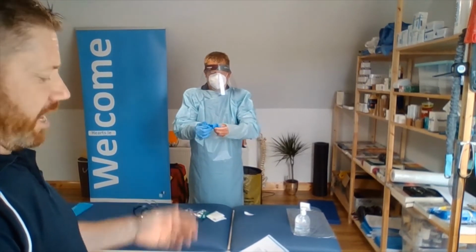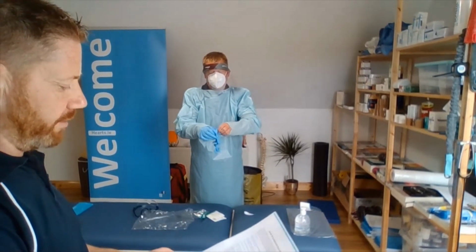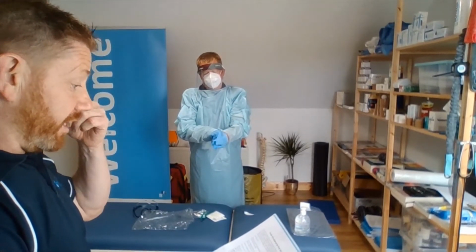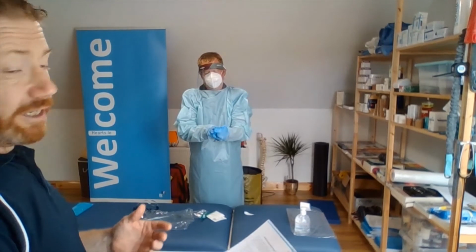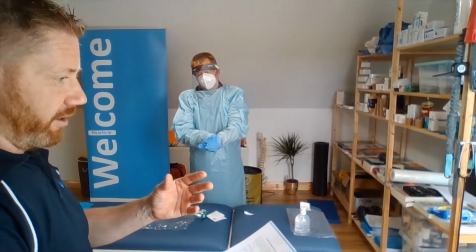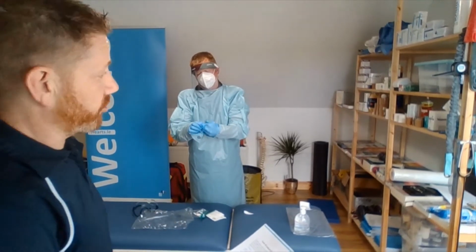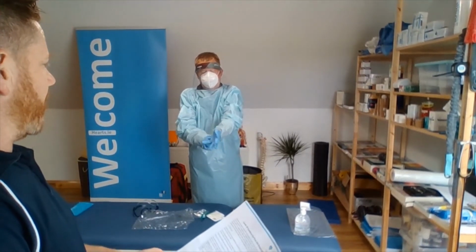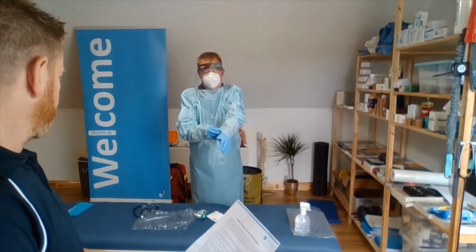So the gloves are on, and it's taking us time putting the gloves on, as we mentioned already. And as I already said, if he needs any assistance at any stage, I can assist him either by talking him through the procedures, or by assisting him to tie the strap at the back, or putting equipment close to him to make it easy for him.